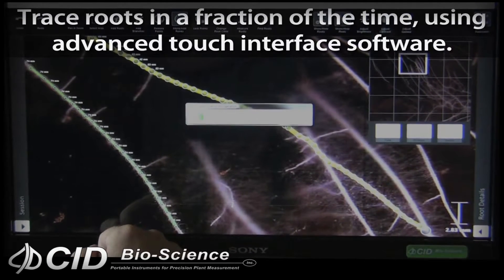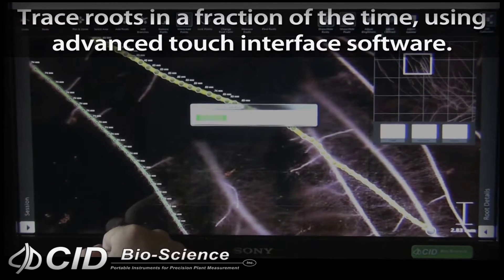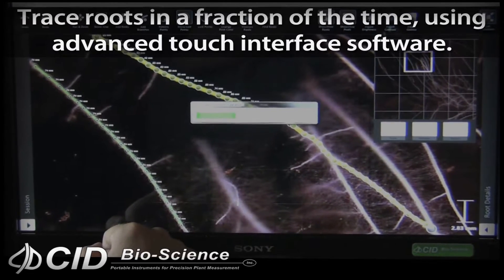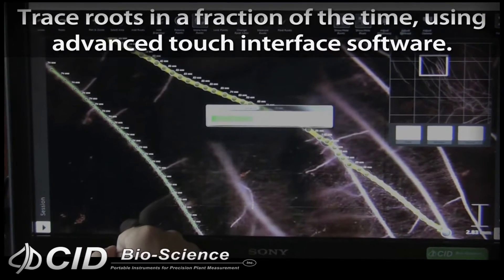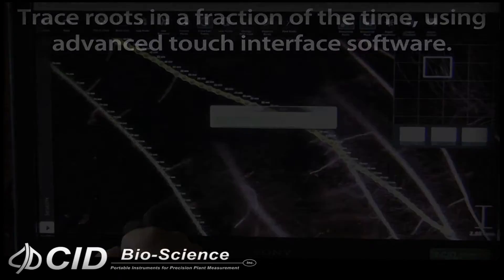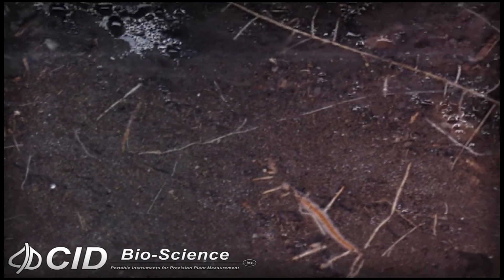Trace roots in a fraction of the time using advanced touch interface software. Monitor root growth, dynamics, taxonomy, morphology, and behavior over time with RootSnap.